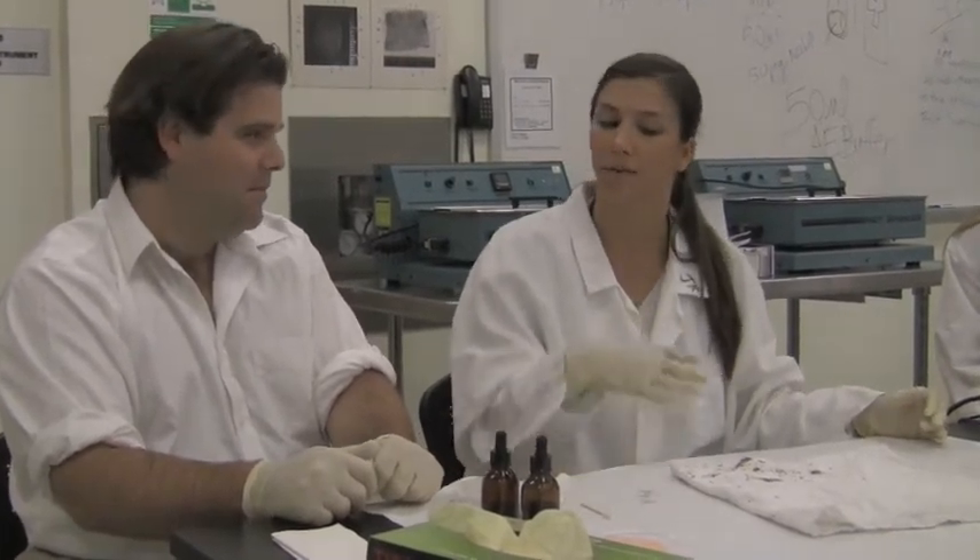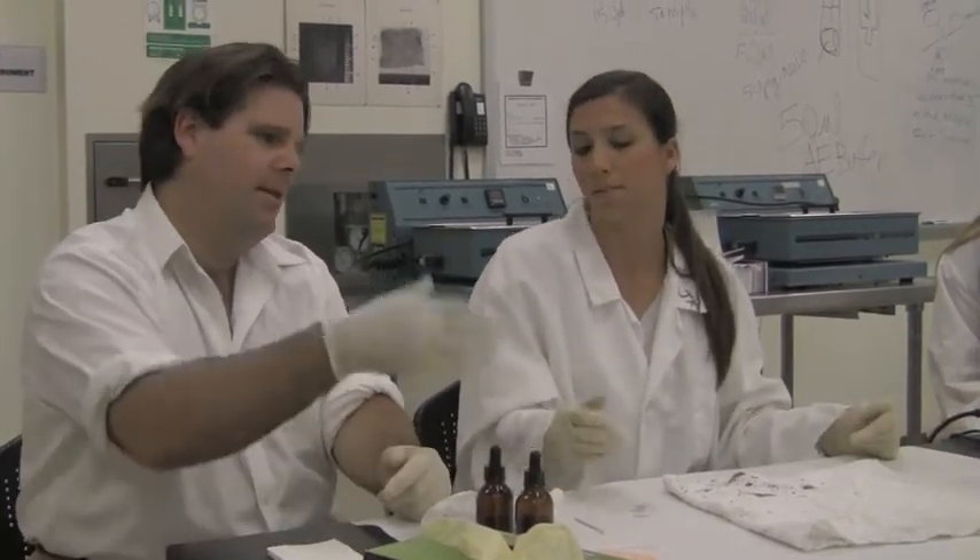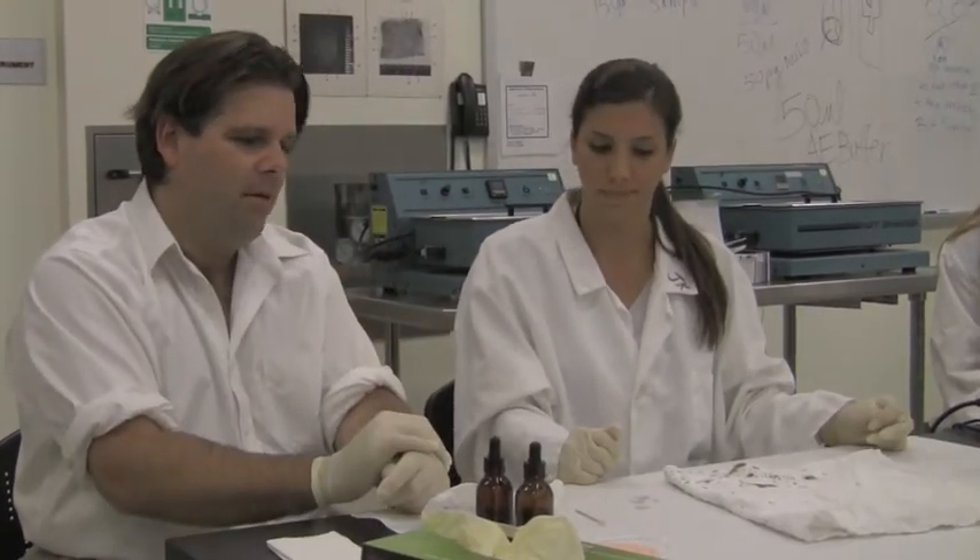Are you confident that this is blood? Not completely, because other things can react with these chemicals, such as plant sources — vegetables, potatoes, horseradish — which could also cause a positive result. That is why you always have to do a confirmatory test after this test. But if there's a negative result, we don't do anything further. If it's a positive result, it could be something else and not blood — so it just goes back in.